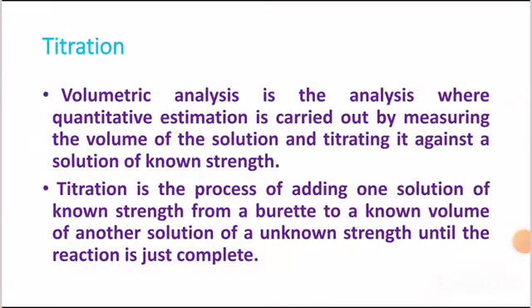Everyone, today I am starting the new practical, that is estimation of water of crystallization in Mohr salt by titrating with KMnO4 solution. Titration. Volumetric analysis is the analysis where quantitative estimation is carried out by measuring the volume of the solution and titrating it against a solution of known strength. Titration is the process of adding one solution of known strength from a burette to a known volume of another solution of an unknown strength until the reaction is just complete.